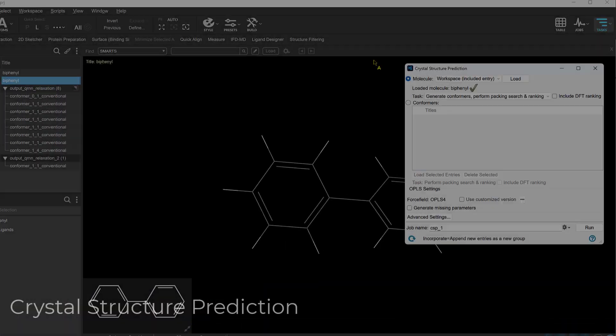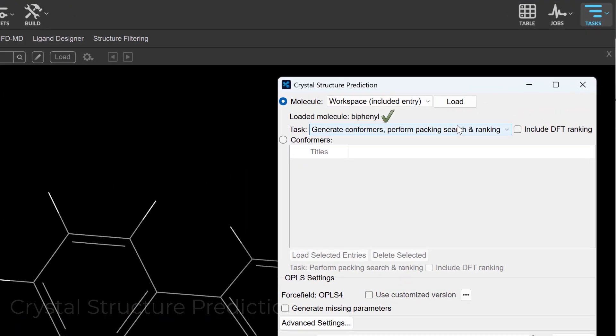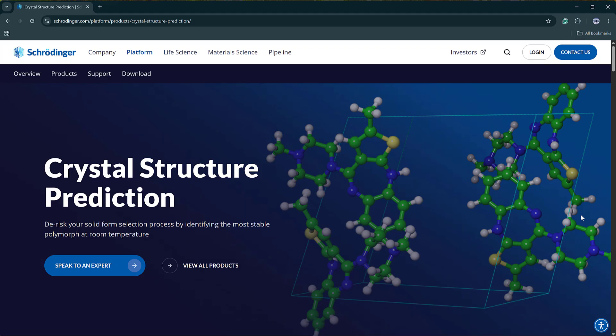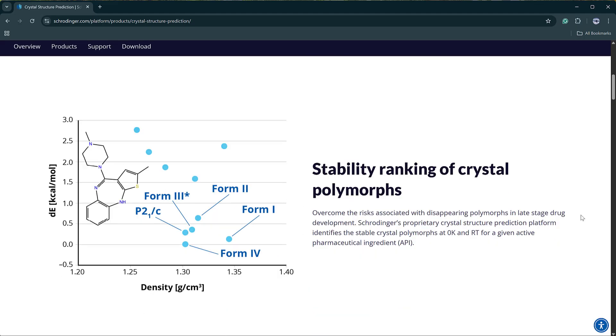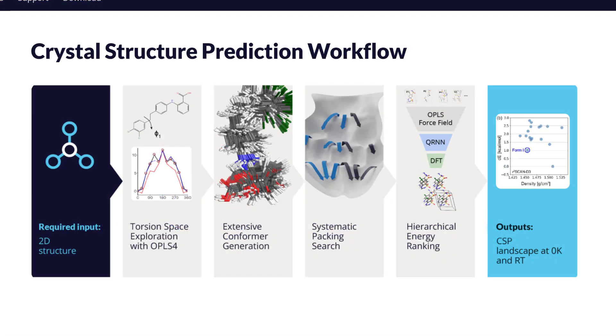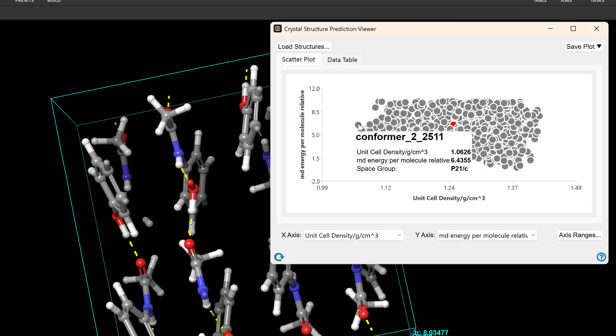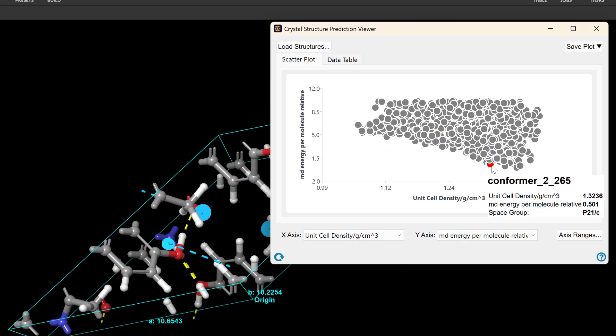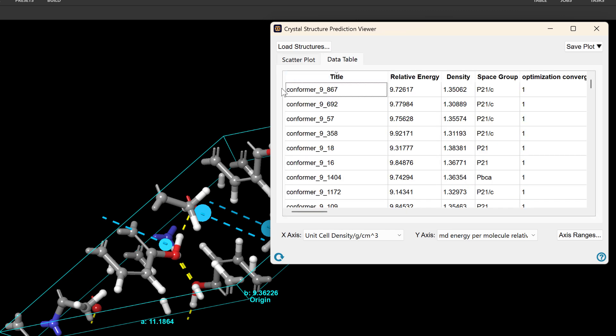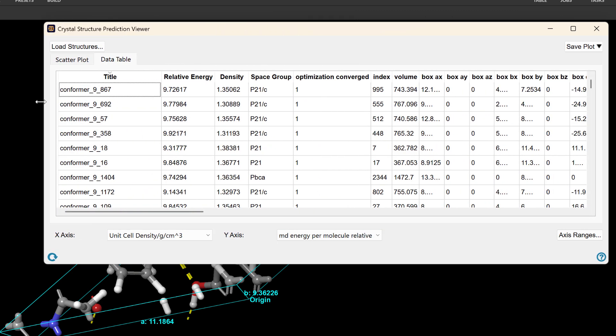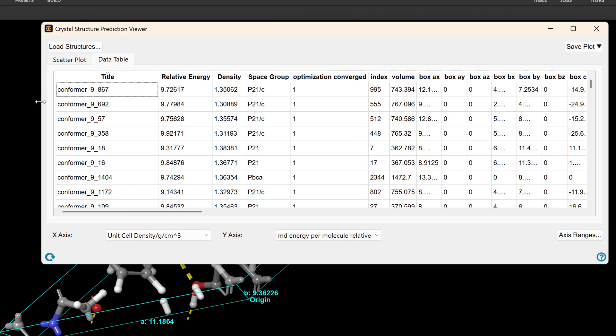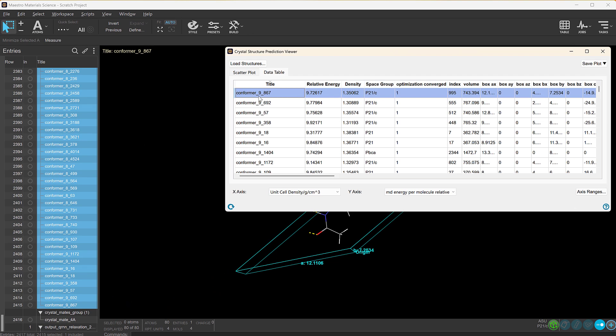First, introducing the new Crystal Structure Prediction Panel, designed to minimize late-stage polymorph risks. It delivers fast, high-fidelity stability ranking of Z' equals 1 crystal polymorphs for your active pharmaceutical ingredient through comprehensive sampling and hierarchical scoring, allowing you to confidently identify the most stable forms at room temperature and de-risk your solid form selection.